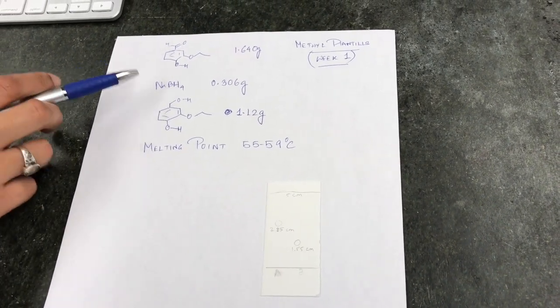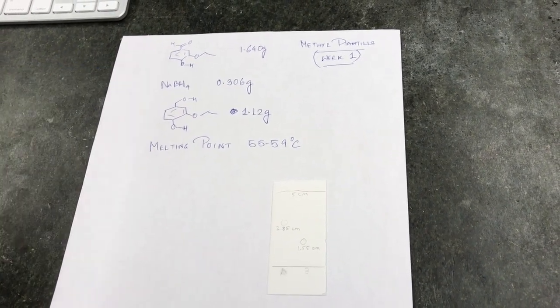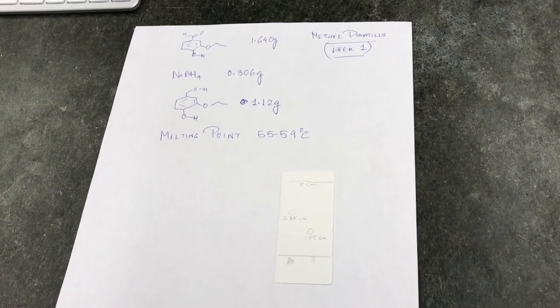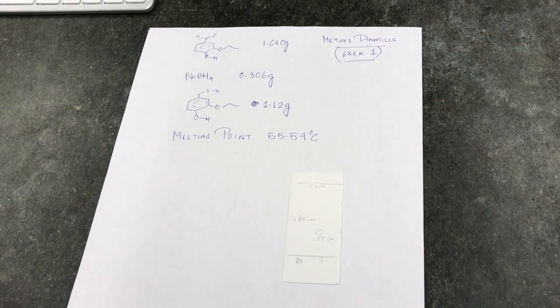These are the different amounts of sodium borohydride, the starting material that we took. From there, you can calculate your percentage yield. Just write down whatever we mentioned during our short videos and clips, and we'll see you in part 2.